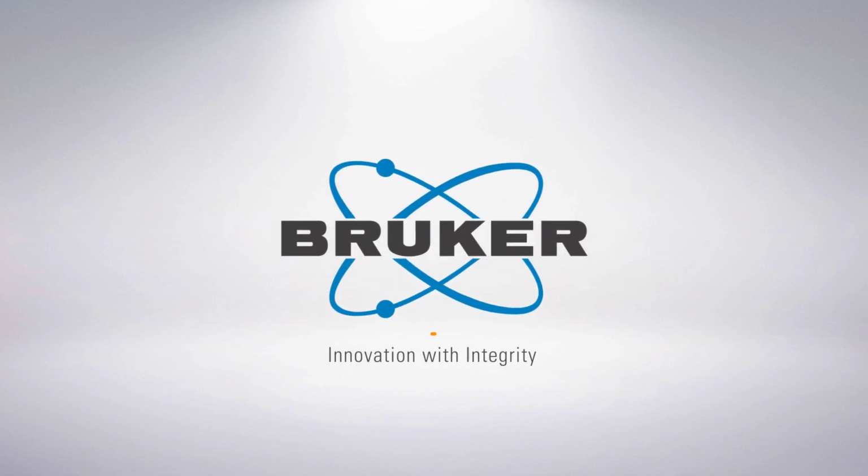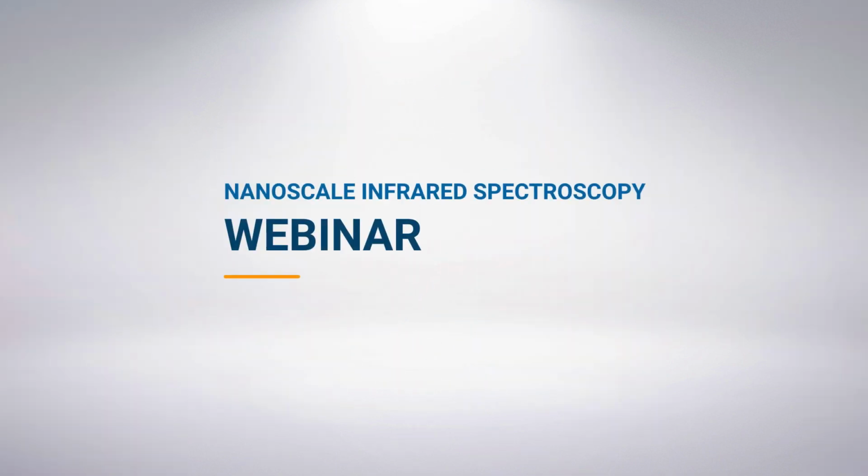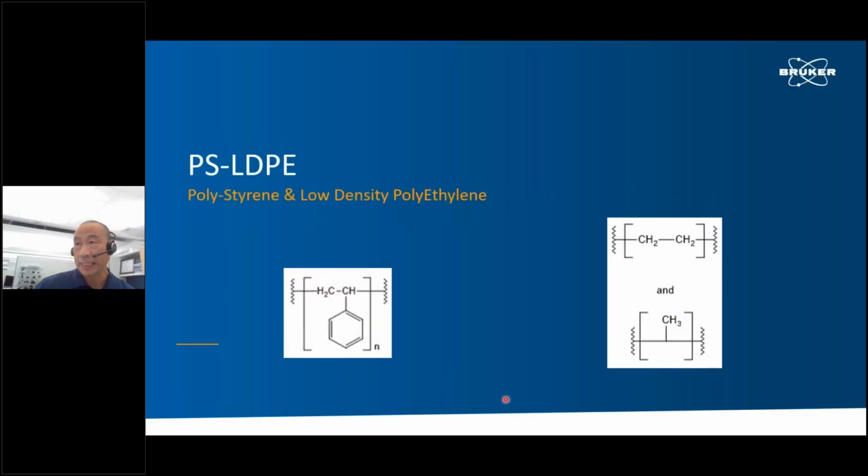So all the data are collected with Bruker Dimension IconIR. I'll start with a standard or model system, PS-LDPE. PS is polystyrene and LDPE is low density polyethylene. So we have these two polymers blended together.